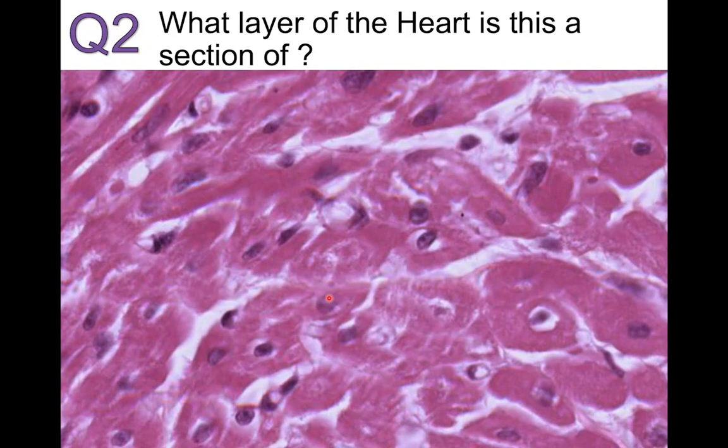The second question: what layer of the heart is this a section of? The question tells us this is a section from the heart, and here we can see longitudinal and transverse sections of cardiac myocytes. So this is a section from the middle layer, which is myocardium.